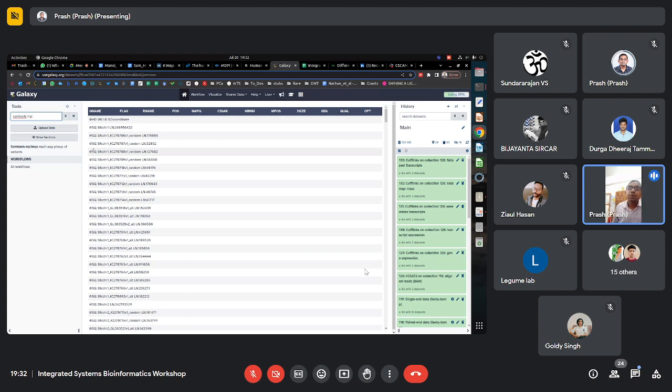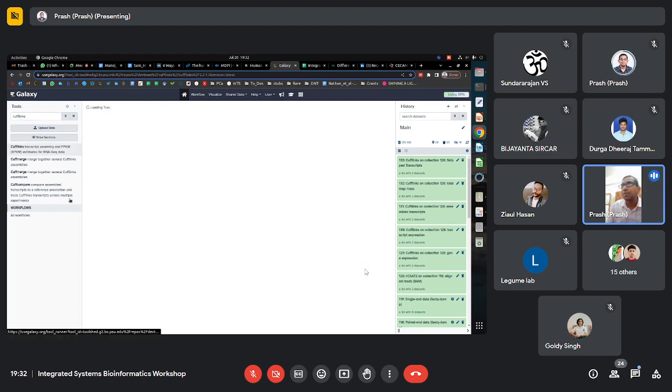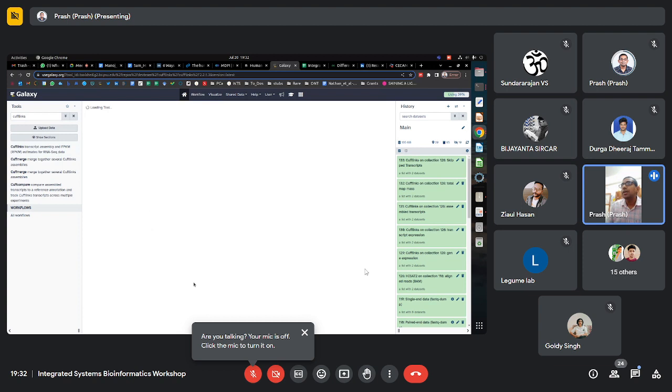But the very first important step that you could do is Cufflinks. We are using a Cufflinks-Cuffdiff pipeline. So run simply Cufflinks, where for individual control and treated samples, it will measure the transcript abundance. Since it's still loading, please have your patience. I already ran it for you. Don't worry. I'm just going to show you how I ran it so that we can save some time.